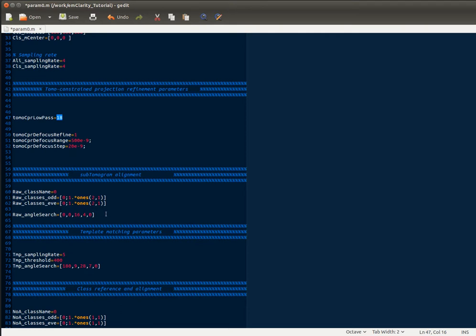For subtomogram alignment, the only thing that you're going to need to really worry about is this number here, which refers to the symmetry applied, and it's only in the C space, so in the plane. So for the ribosome it's going to be 1 because it's a C1 symmetry. If you're working on something with six-fold symmetry, you put a 6 there.